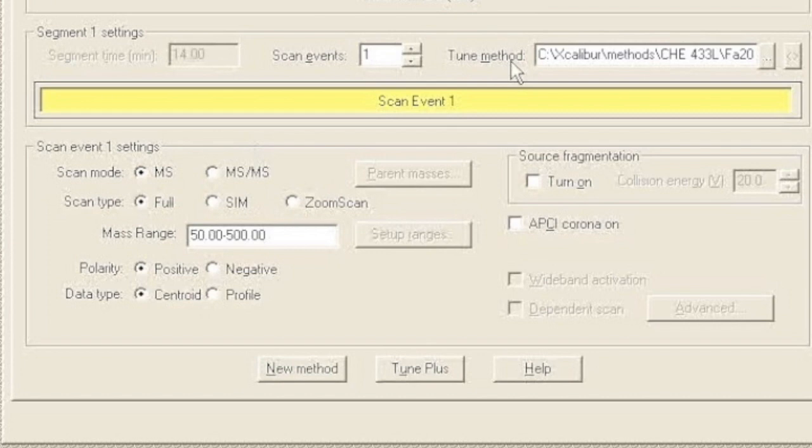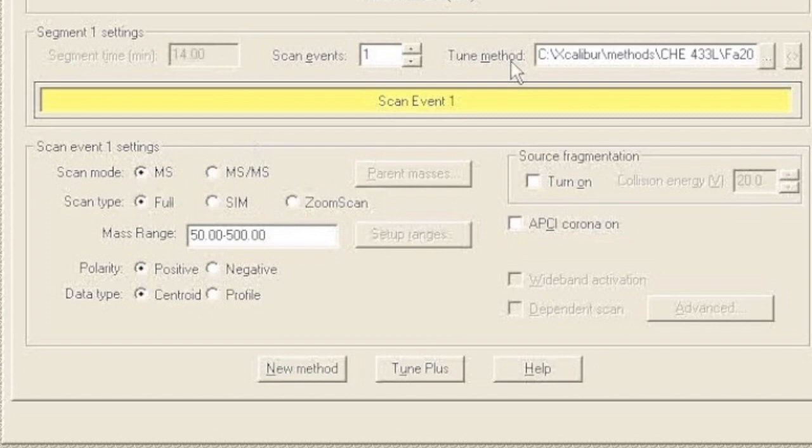Just like with the GCMS, one of the most important things about the method is to make sure that the time the mass spectrometer is detecting ions is the same time that your gradient is set for. So make sure that your chromatography time matches your detector time.